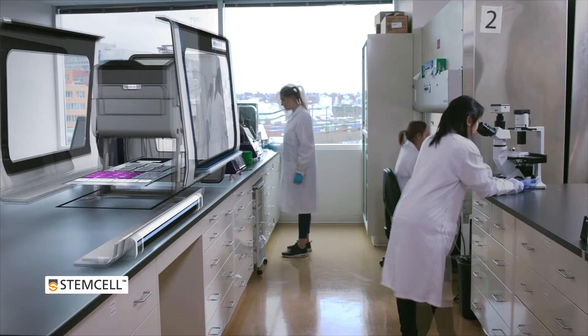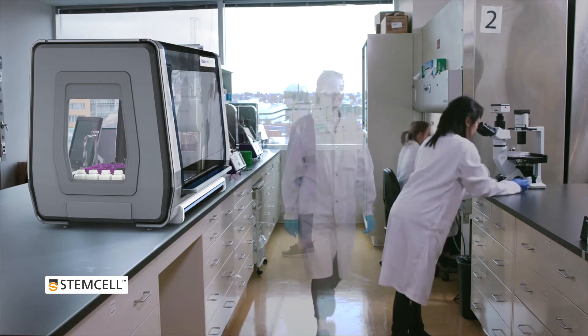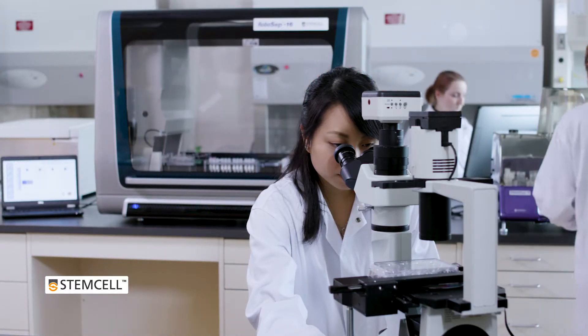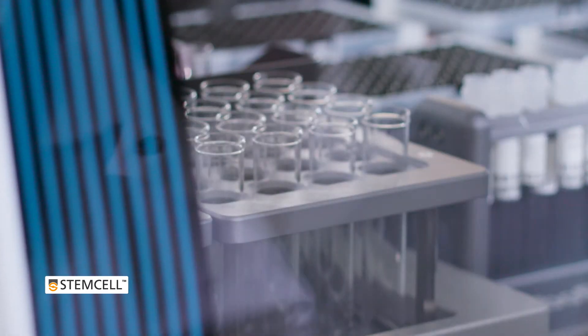Automating cell isolation with RoboCEP-16 increases lab productivity and efficiency while minimizing sample handling errors and reducing the risk of exposure to blood-borne pathogens.